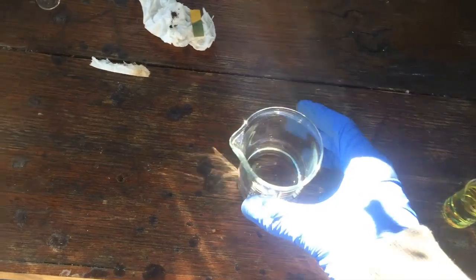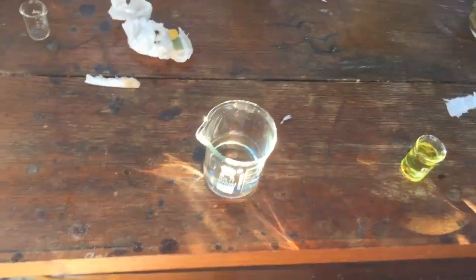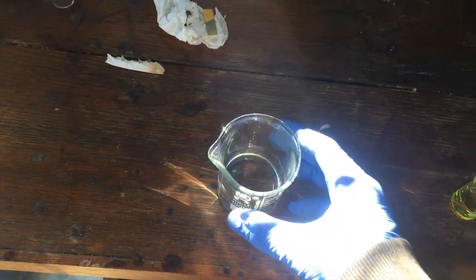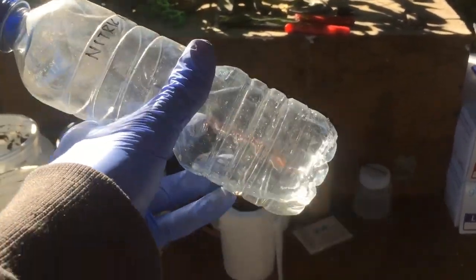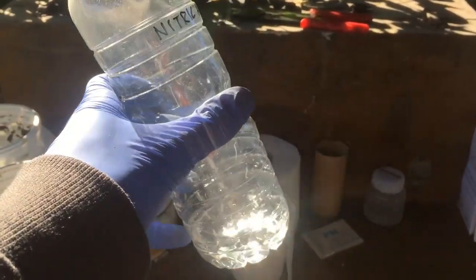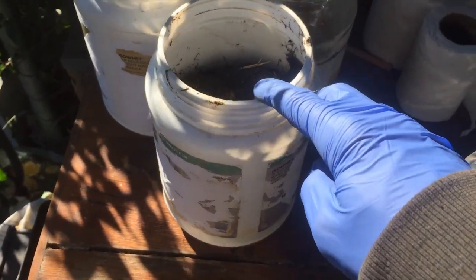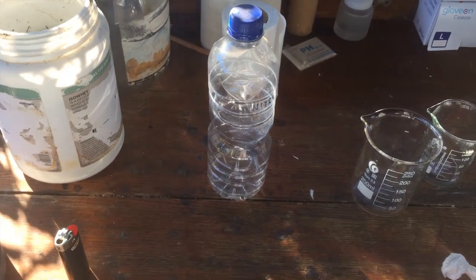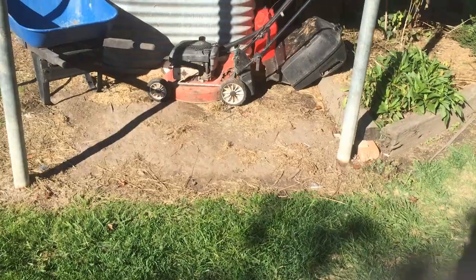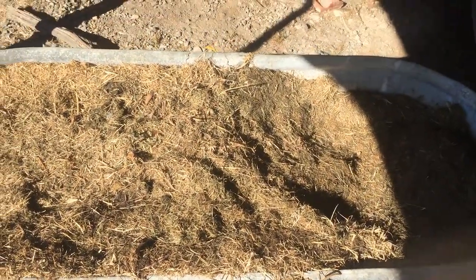I'm a little bit disappointed that the acid wasn't concentrated enough to dissolve copper on its own, but we did make nitric acid from just composting grass clippings, and I think that's pretty cool. Honestly though I wouldn't recommend this way of making nitric acid — the yield is so low. This is really not very concentrated nitric acid. Maybe if you had compost with a higher nitrate content this method would work better, but the amount I got is just not very much at all.